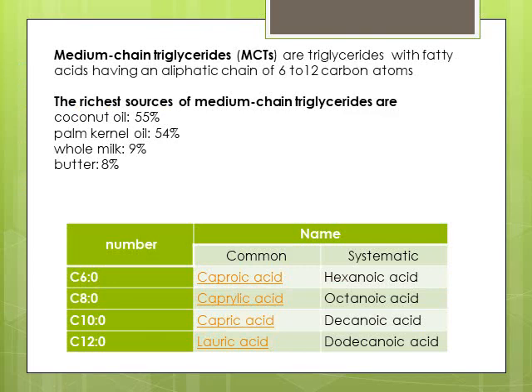MCT is a triglyceride with fatty acid having aliphatic chain of 6, 8, 10 or 12 carbon atoms. It can be plant-based or from milk product. The coconut oil has the highest concentration of MCT.